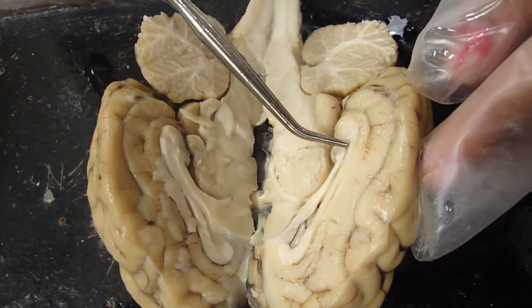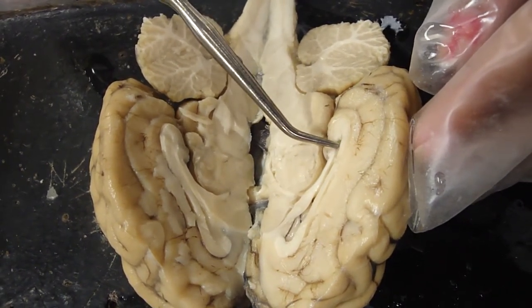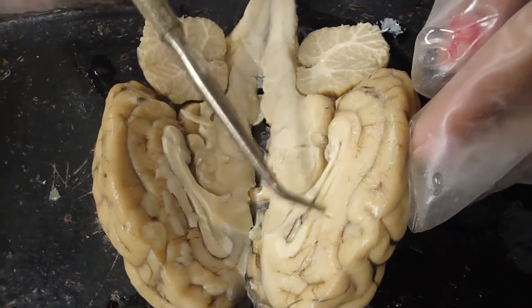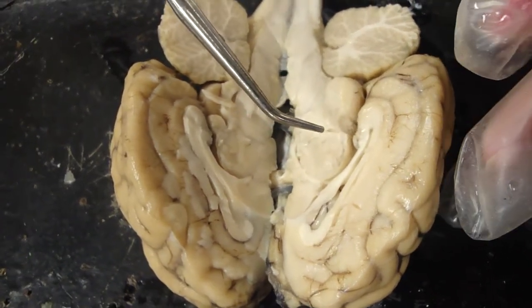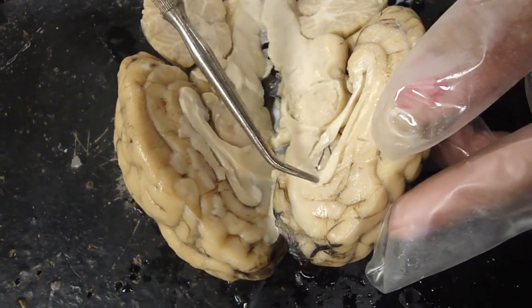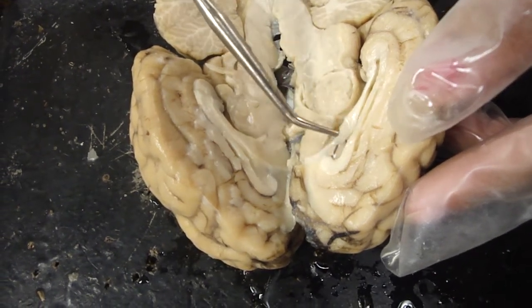I'm going to open up the ventricle on this side so we can see where we're at. And so she switched halves. It was actually better on that half she was showing. A little there behind this membrane. This shows it quite well, actually. Here's the corpus callosum. And then this white projection coming down here will be the fornix. And the lateral ventricle would be up inside there. Corpus callosum. And this part right here is the fornix.